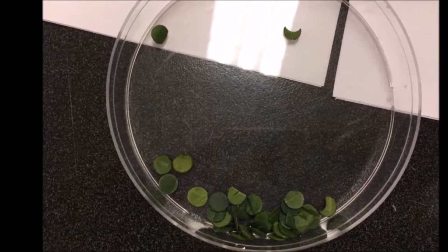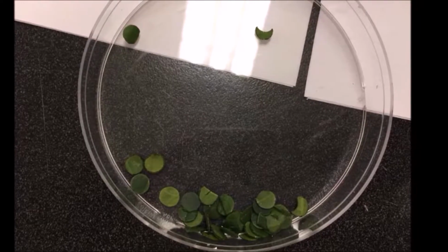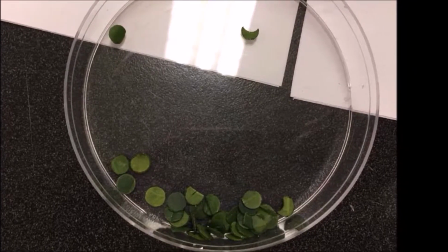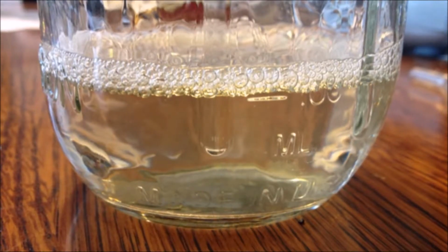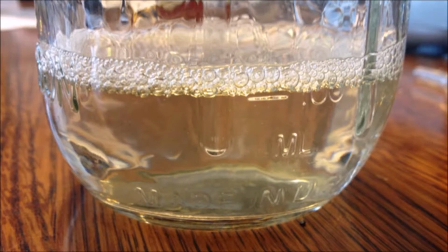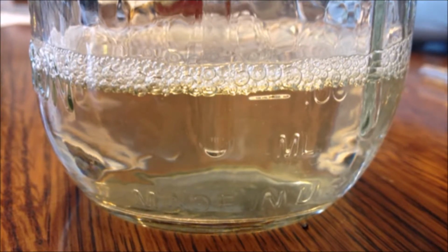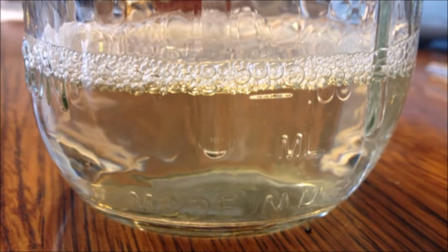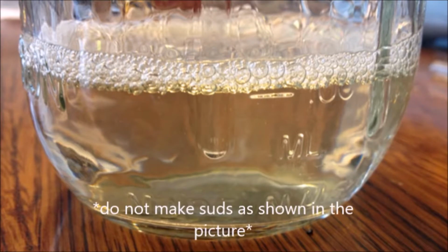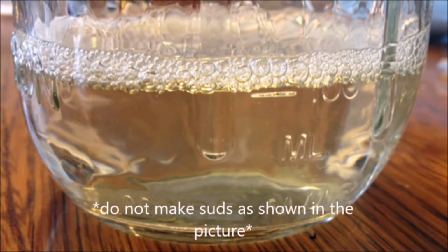Using the hole puncher, punch out 30 discs of the spinach leaves while being careful to avoid the veins. Set the discs aside. In a graduated cylinder, measure exactly 50 ml of distilled water. Then, in the diluted soap solution beaker, make a diluted solution of the liquid dish soap. Using a pipette, add 5 drops of the dish soap to the measured 50 ml of distilled water. Using a stirring rod, gently stir the soap with the water. Be careful to avoid stirring too fast and making suds.